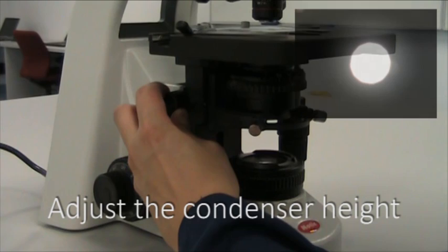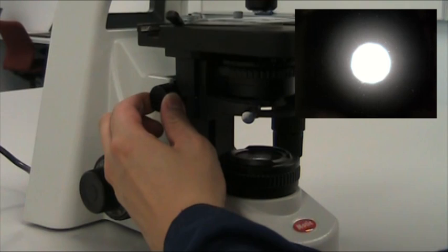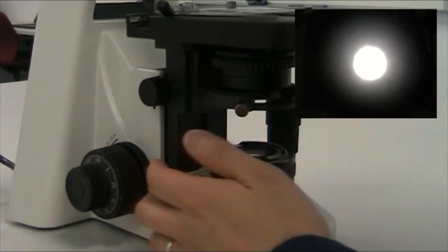The condenser focuses the incoming light onto your specimen. To make sure the light is focused at the right plane, adjust the height of the condenser until the edges of the field diaphragm become sharp.